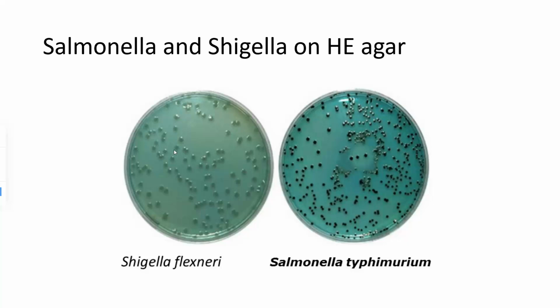Now, E. coli and Shigella are very similar, so this agar is useful in differentiating those two. If you put E. coli or Shigella on the MALDI, it won't be able to distinguish them. So we typically have to have more tests that help differentiate those. This is one of the agar plates that can differentiate them.